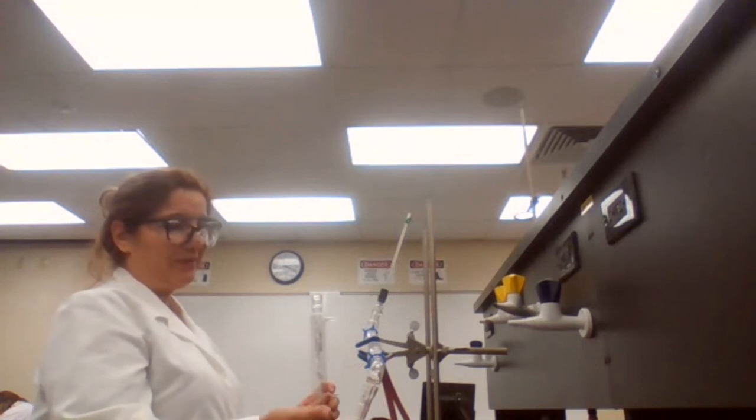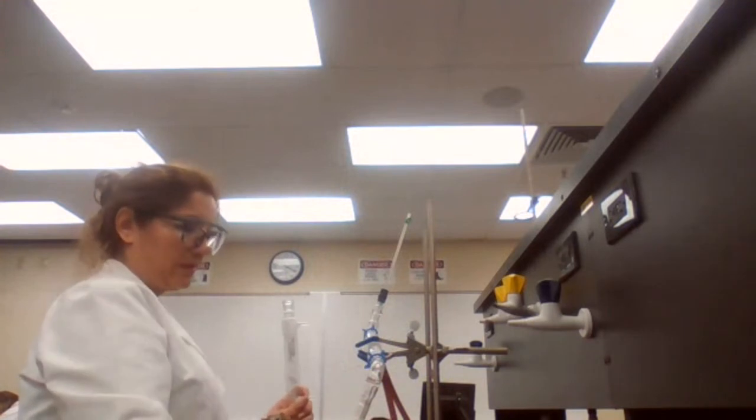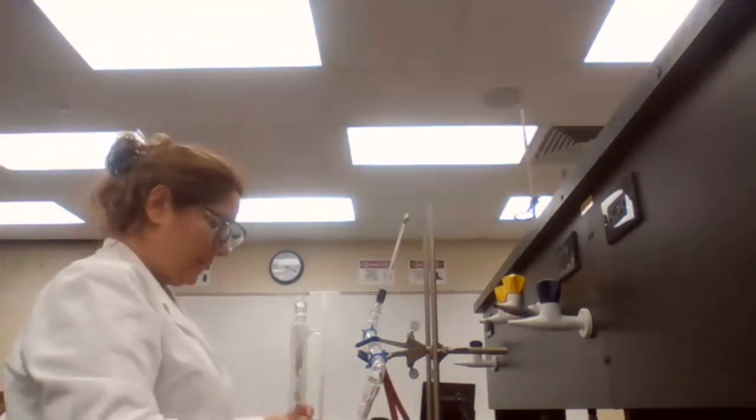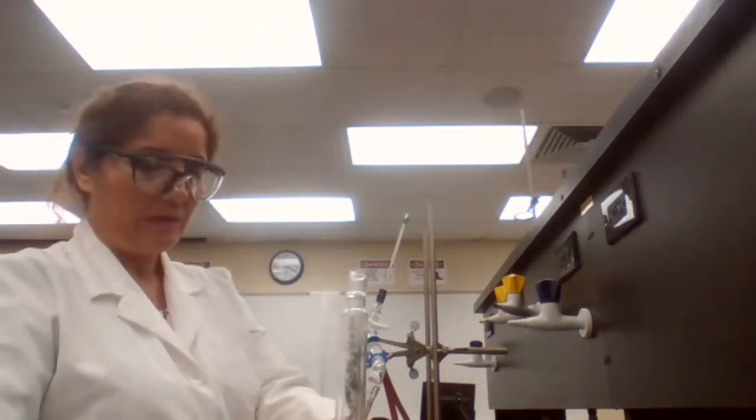So the level of the receiver is going to go higher. So we have to add another ring stand with a utility clamp to hold the graduated cylinder high. So let me go ahead and do this now.